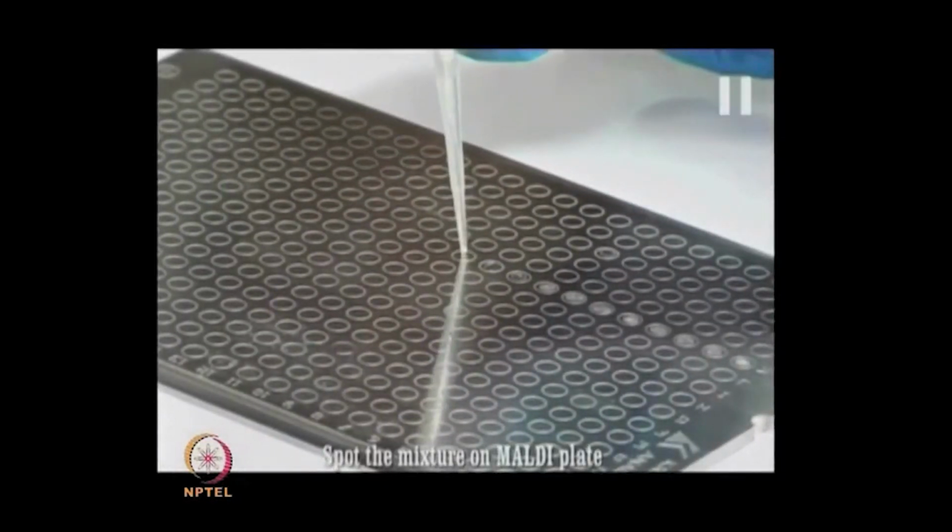So, spot the mixture on the MALDI plate. How uniformly you can plate these mixtures on the MALDI plate ensures good spectra and data quality later on.